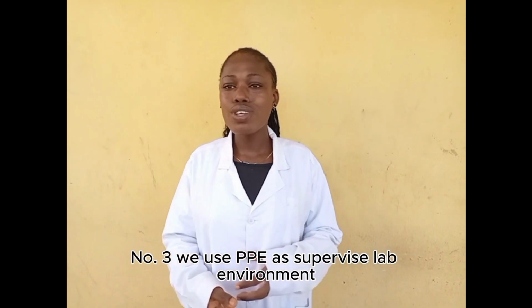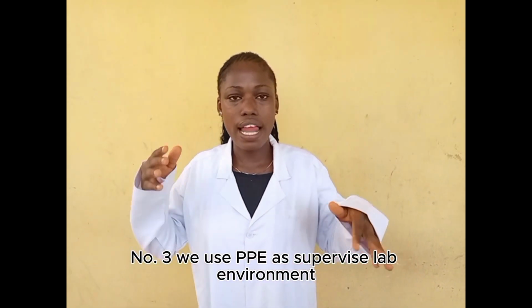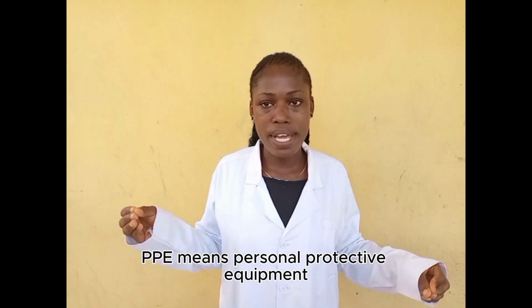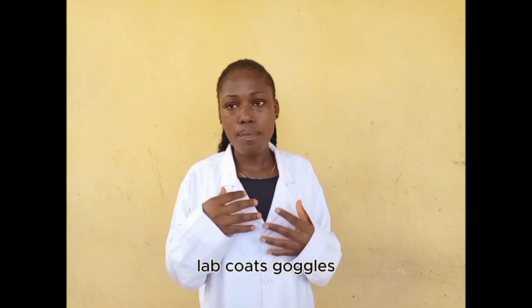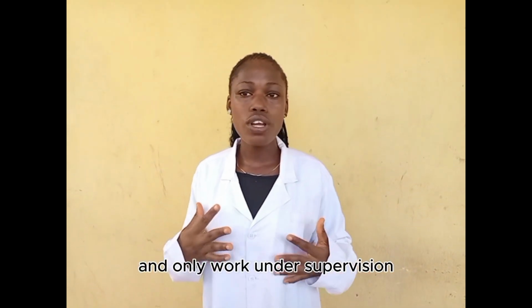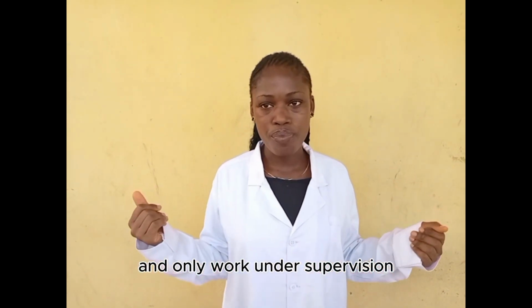Number 3, we use PPE in a supervised lab environment. PPE means personal protective equipment, like gloves, lab coats, and goggles. We wear them to protect ourselves and only work under supervision.